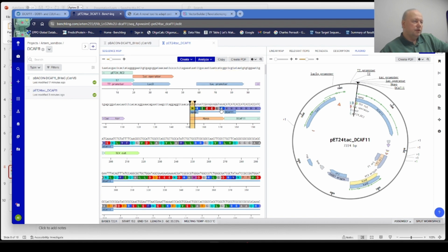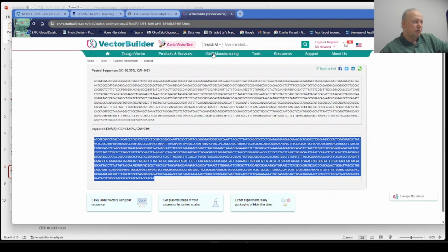As you can see here, there's an expression enhancing peptide we call MPEP. Silky and I came up with it a long time ago, and we've been using it very successfully for a number of years. And here's a nice 8 His tag, followed by, of course, our simple TEV site, ENLYFQG. The sequence has been re-optimized in VectorBuilder, although I could have used the Benchling optimization as well. It doesn't really make much of a difference.